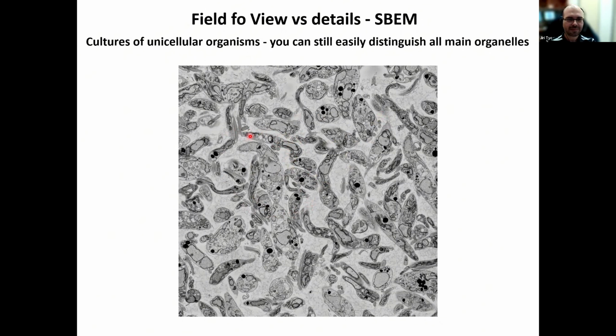So I think the best is to combine having one cell with a really good resolution and then have a whole bunch of other cells where you can tell whether all the cells actually look the same as the FIB one or not. This is the example of one cell cropped out of that data set.